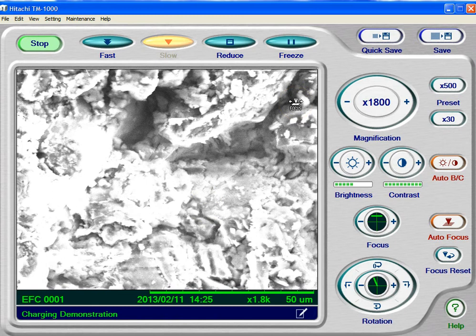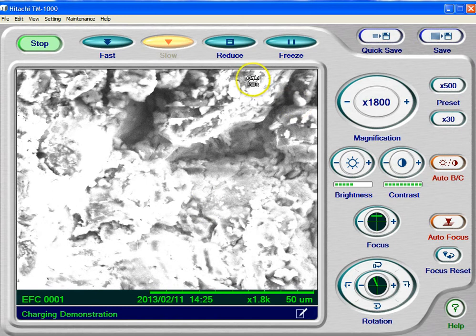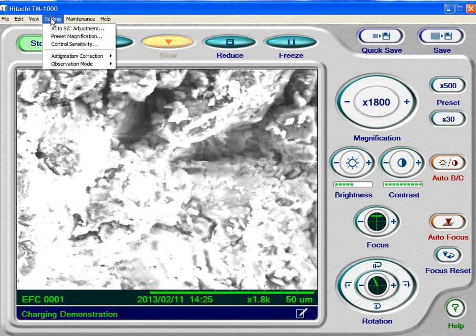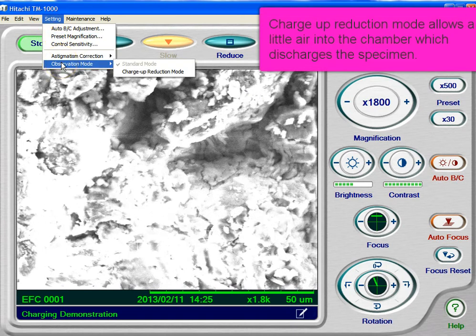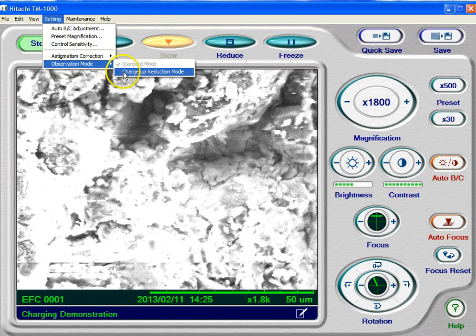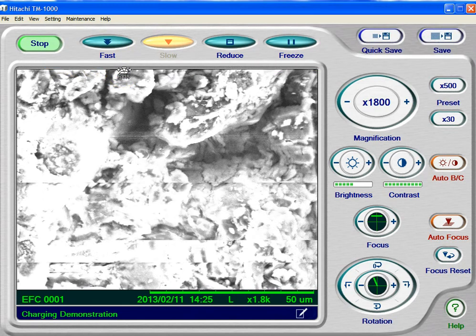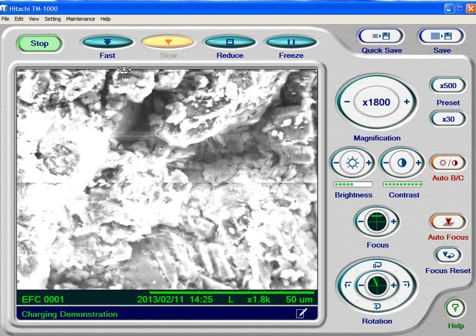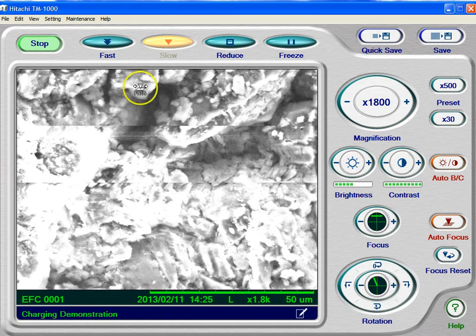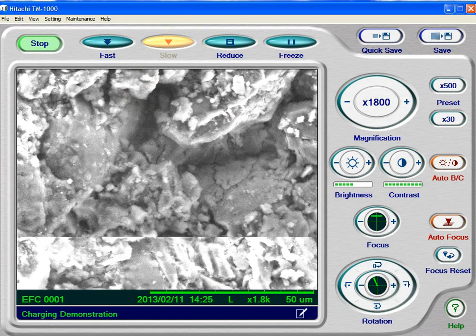Wow, this is really charged up now. So, how do we fix this? Well, with the TM-1000, we can allow a tiny bit of air into the chamber. Under Settings, I'm going to go to observation mode and go to charge up reduction mode. The scope clicks and it lets a tiny, tiny bit of air into the chamber — that's enough air to allow this charge to dissipate. You can already see the effects of that; we're starting to see that charging disappear.